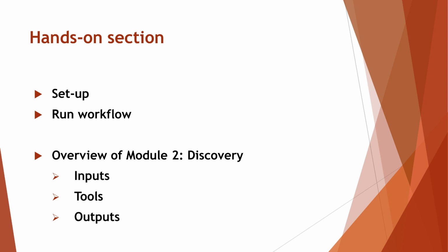Similar to the previous video, I highly recommend having different tabs open for Galaxy EU and the Galaxy Training Network website. This hands-on section will include a brief setup that will lead into starting the workflow. And while the workflow is running, I will cover the inputs, the tools, and end on what outputs we expect to generate.